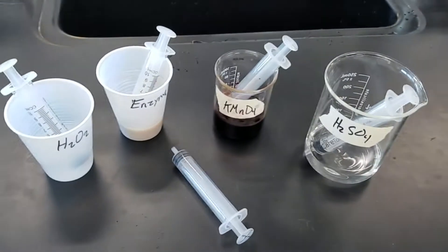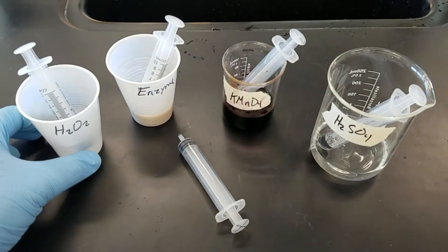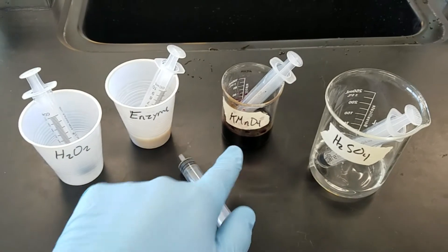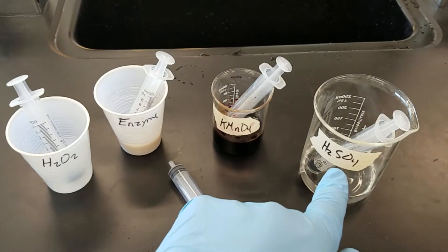In your lab you'll notice four chemicals already prepared. We've got hydrogen peroxide, a yeast enzyme solution, potassium permanganate, as well as sulfuric acid.